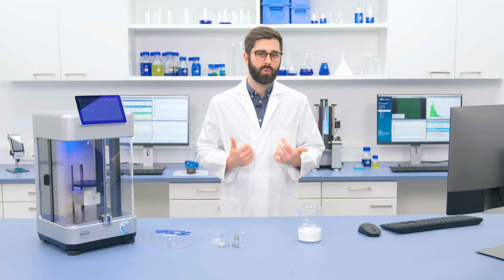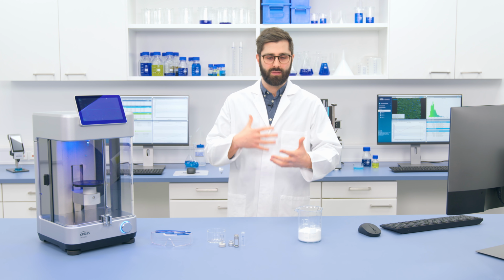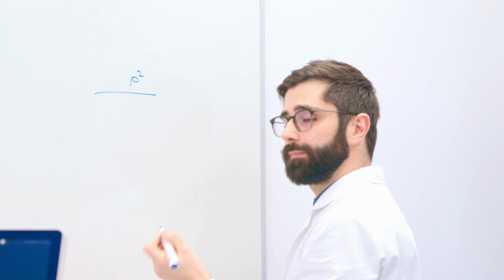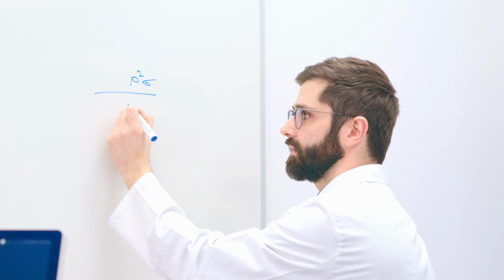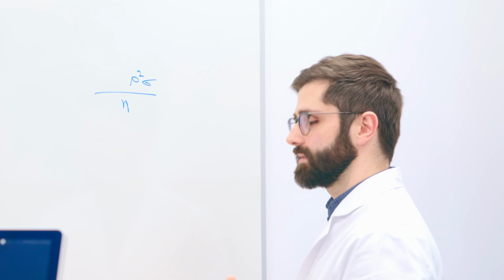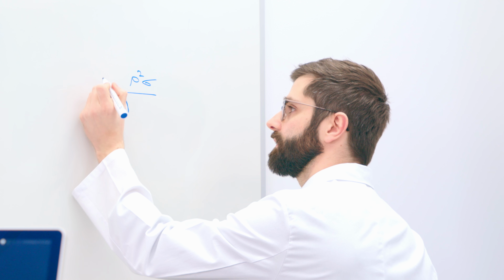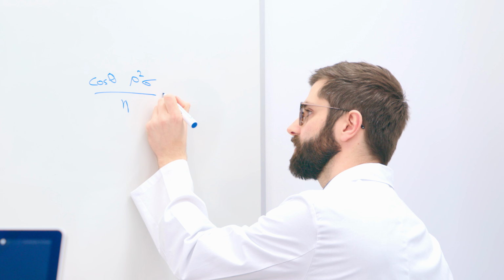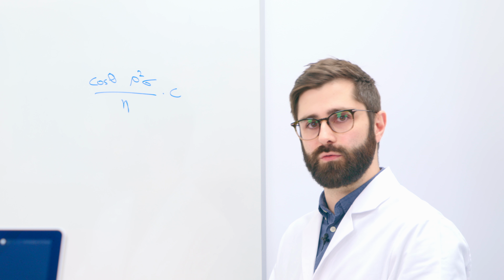In the Washburn method, we use an equation that relates all of the properties of the liquid and solid with each other. For porous materials, the absorption of a liquid into that material is dependent on a few factors. So first of all, for the liquid itself that's being absorbed, we need to consider the density, the surface tension, and the viscosity of that liquid. For the solid that's absorbing the liquid, we need to consider its contact angle, which we give by cosine theta, and something called its capillarity, which relates to the capillary force that's pulling on the liquid.